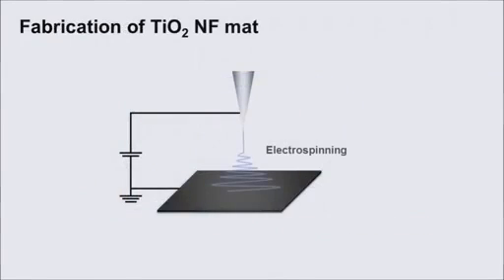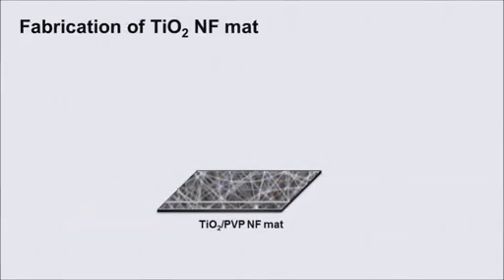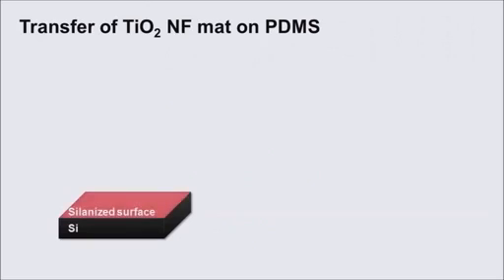To fabricate titanium dioxide nanofiber mats on silicon substrate by electrospinning, the silicon substrate is first silenized, coated with PDMS, and pre-cured.